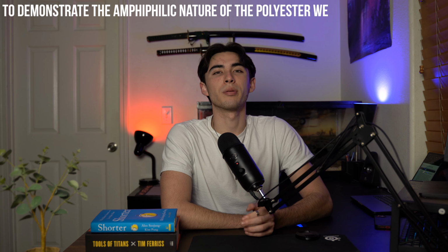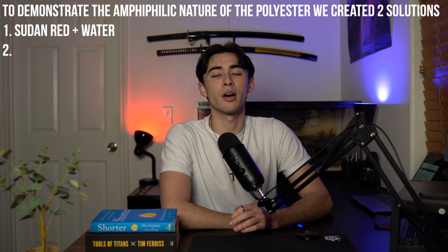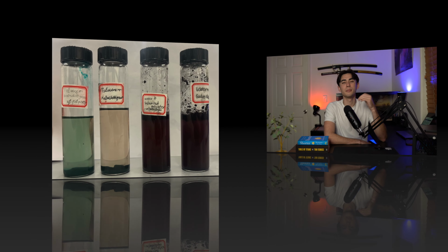Now, to demonstrate the amphiphilic nature of the polyester, we created two solutions. One consisted of water plus Sudan red dye, and the other consisted of malachite green dye with toluene. We created two of each solution, one to be used as the control and the other to be used with the polyester. Once the amphiphilic polyester was added to the two vials, the solutions were then shaken and allowed time to settle. The following solutions are observed.